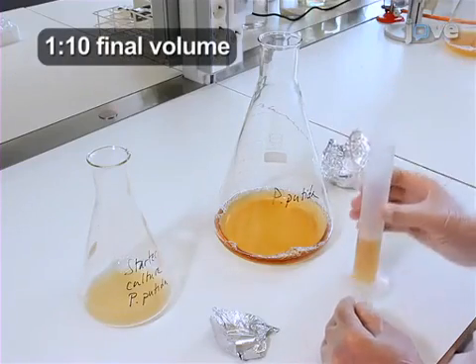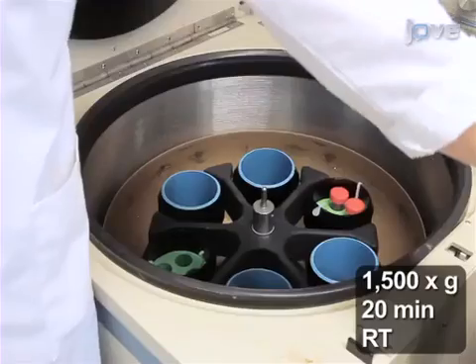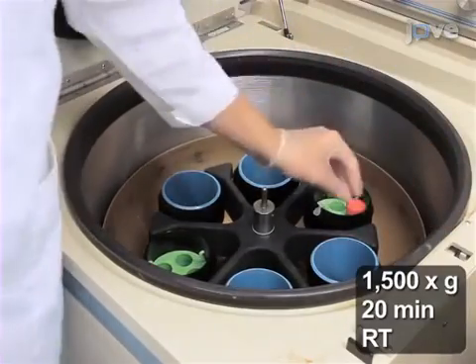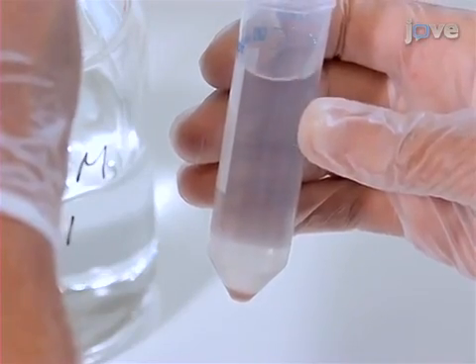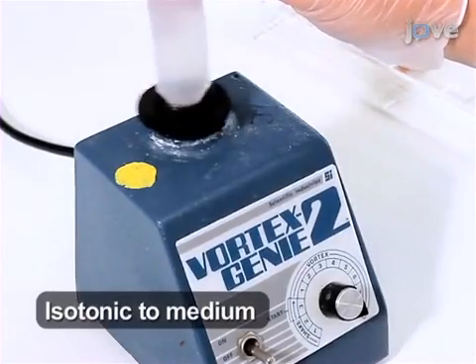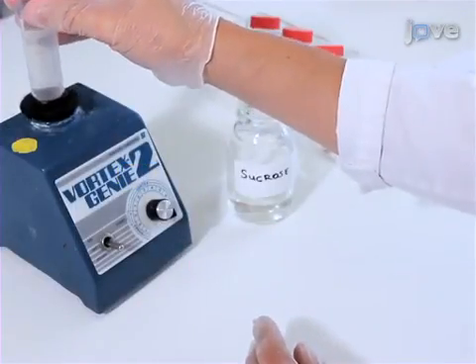Transfer an aliquot of the culture to fresh TSB, and grow for 16 hours. Harvest the cells by centrifugation at 1,500 times G for 20 minutes at room temperature. Wash the cell pellet by re-suspending it in 150 millimolar sodium chloride. Pellet the cells, and re-suspend them in formulation medium.